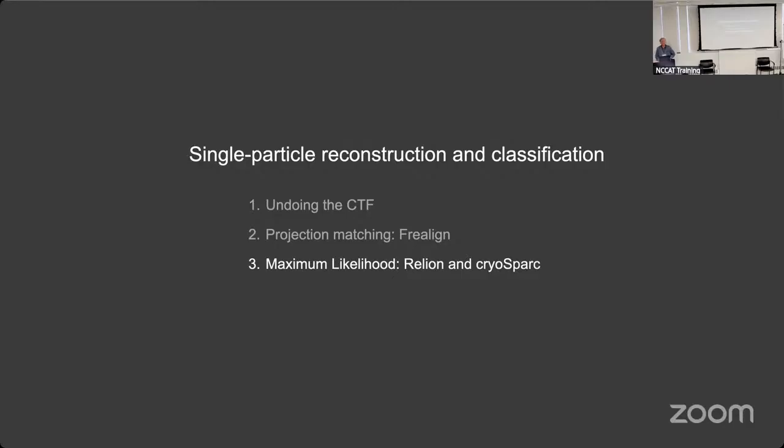Right. So that would not be too bad a place to start, to use an AlphaFold model of your macromolecule. I mean, much better than just some kind of random volume. Following up on that, if your data is very low resolution, would an AlphaFold model bias your data? Well, anything you pick can bias your result. So at the end, I will tell you about fairly robust ways of working without a starting model, and so you can hold your starting model questions for a little while.